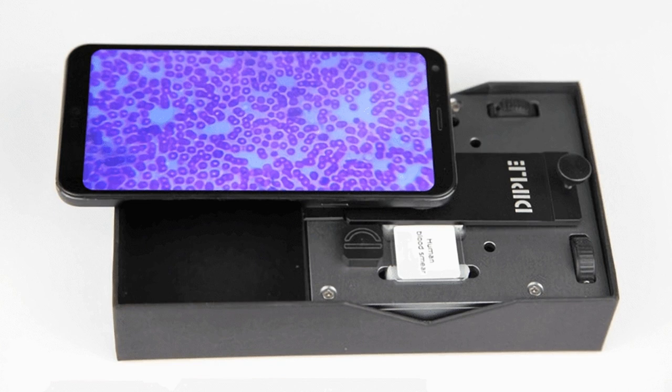There is something fascinating about looking at objects that you cannot normally see with your naked eye. Of course, carrying a microscope around for whenever the whim might hit you is not practical. An optics startup is looking to change that with a compact device that turns any smartphone or tablet into a microscope.